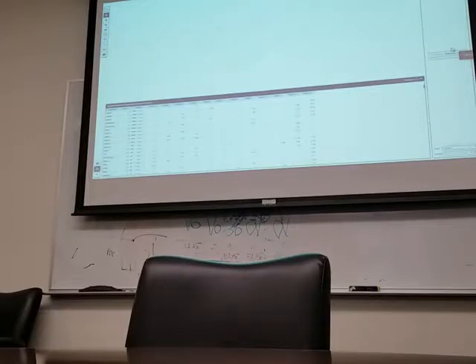Oh, either that's the kappa or lambda. Yeah. But you said there's some that are different, right? You said some are similar, and that's just a slight missed call, and some are different, and that's something strange.